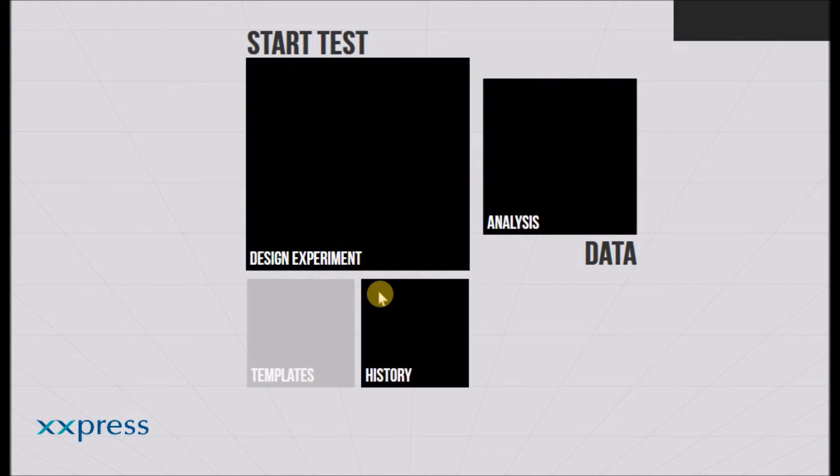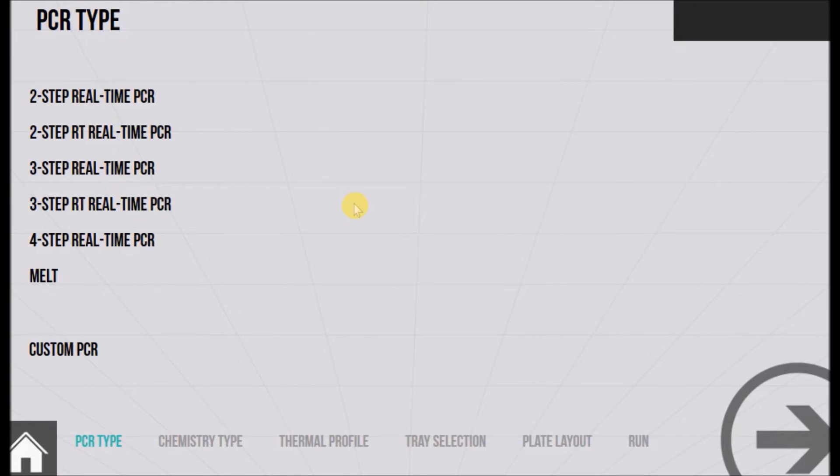The final tab is the design experiment tab which enables users to create an experiment from scratch, which is what I'll show you in this video. First select the type of PCR to be performed, whether it's a 2-step PCR or 3-step PCR for example. Click the next button to confirm.